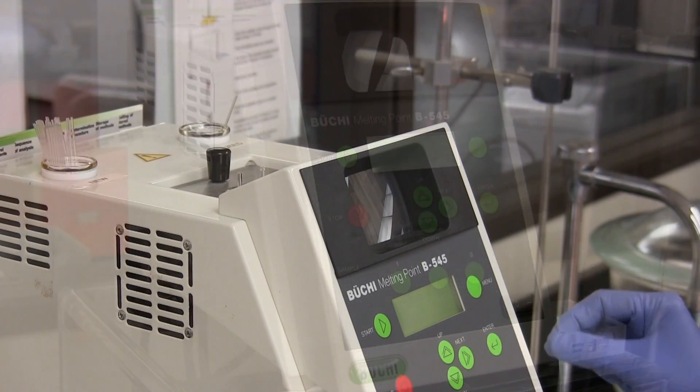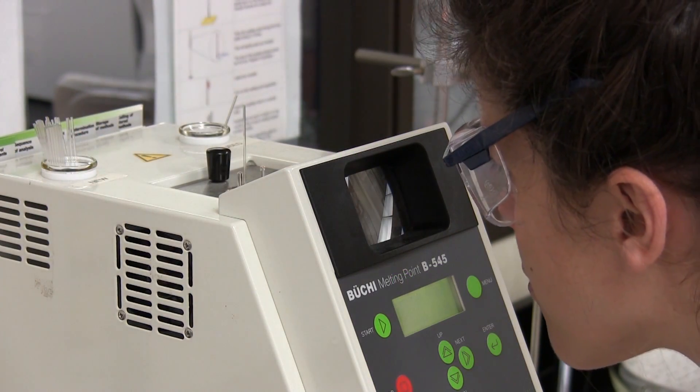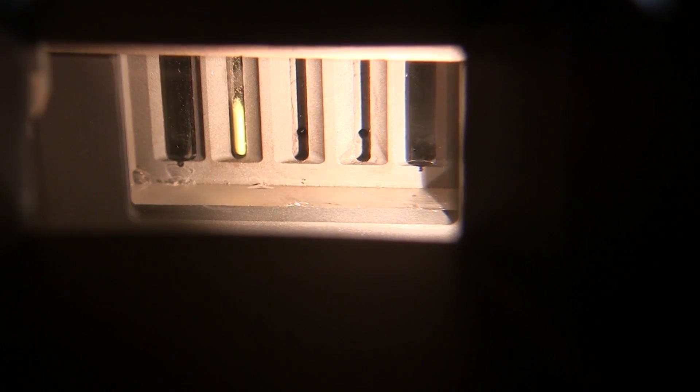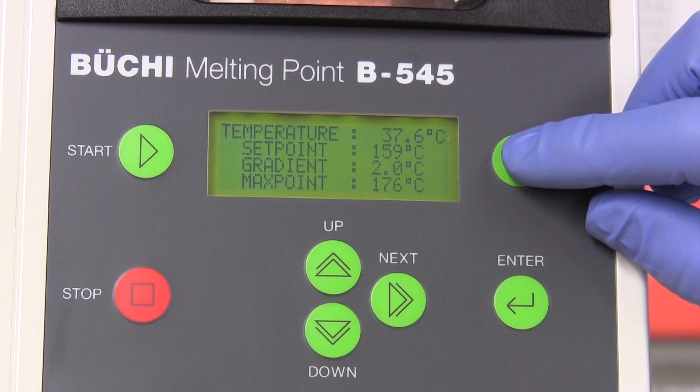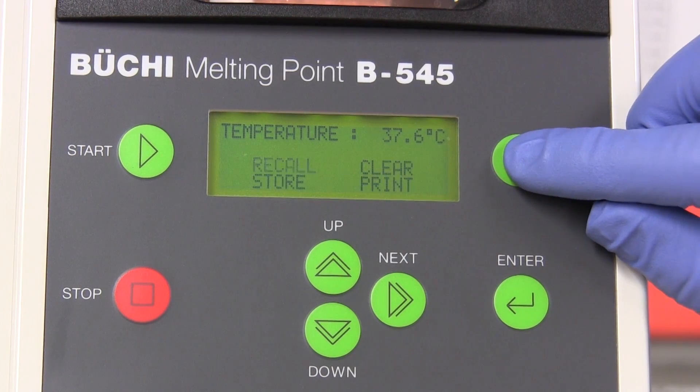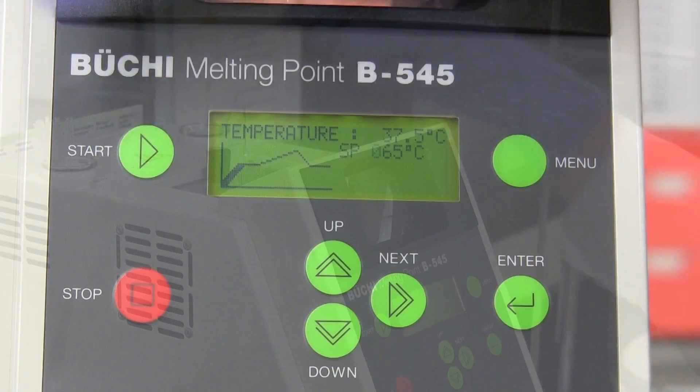This video will give you a close-up view of melting point determination using the Buki apparatus. The melting points of up to three solid samples can be determined simultaneously, but in this demonstration we will prepare just a single solid sample for melting point determination.